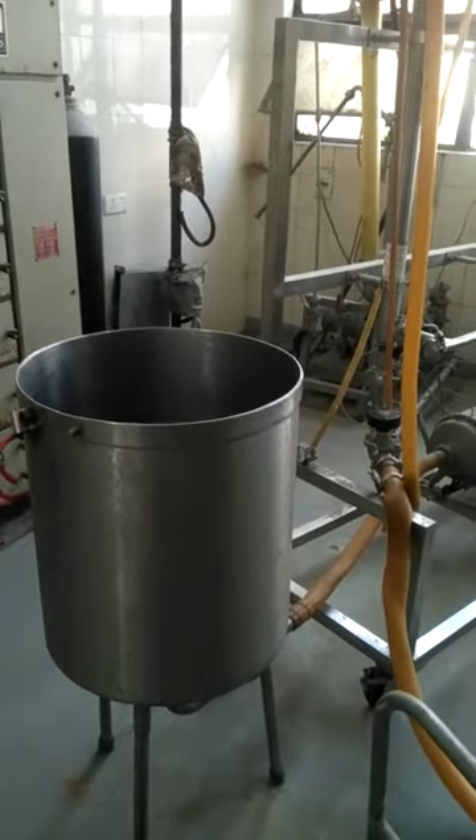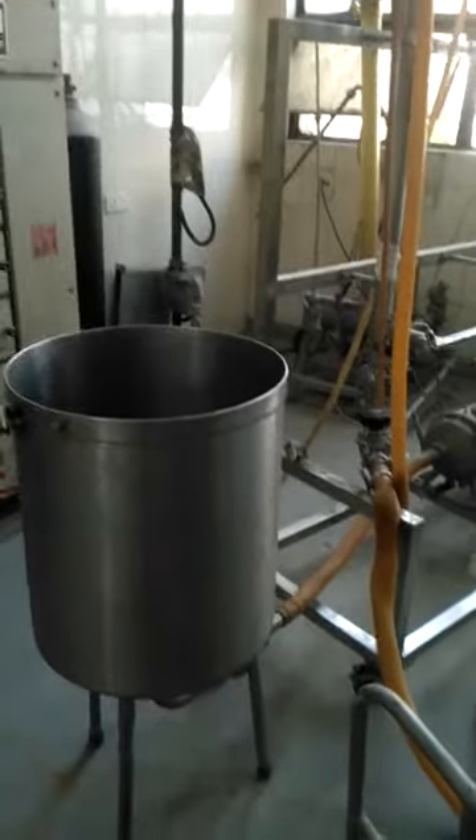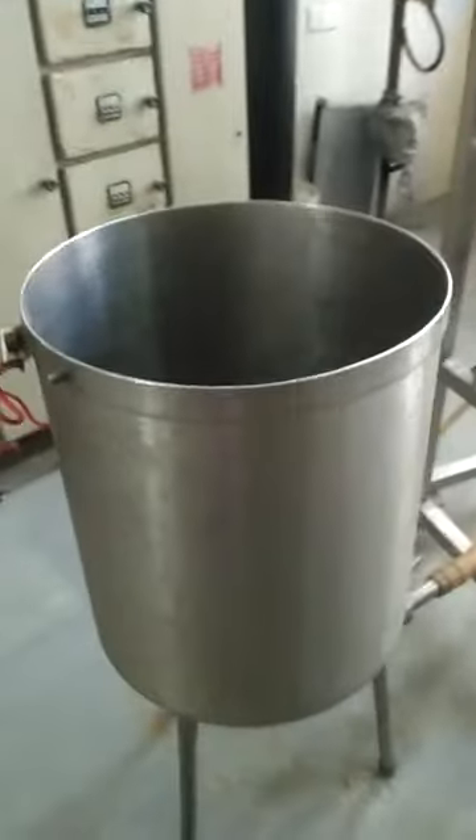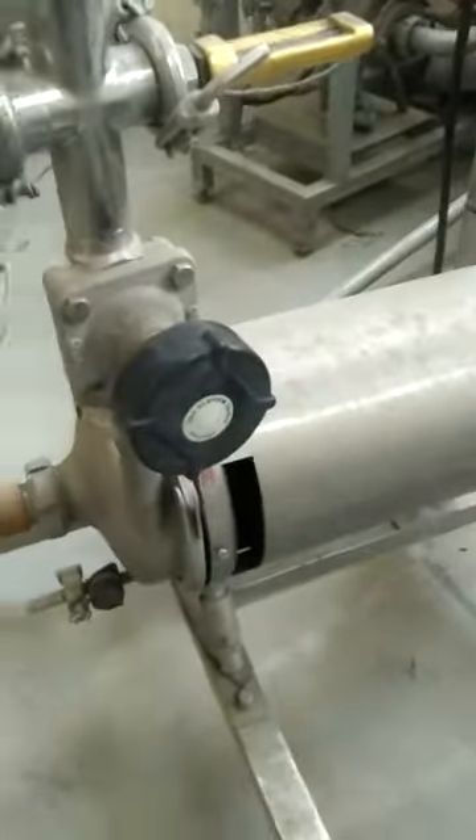Dear students, today we will be studying an ultrafiltration plant. Here we can see the balance tank. From this balance tank, this pipeline goes via the suction line to this centrifugal pump, which is the main feed pump.